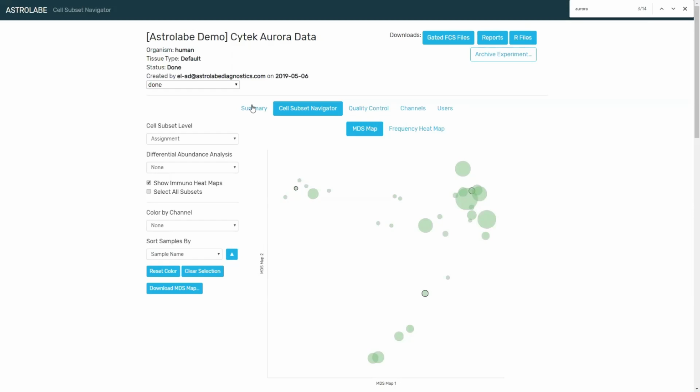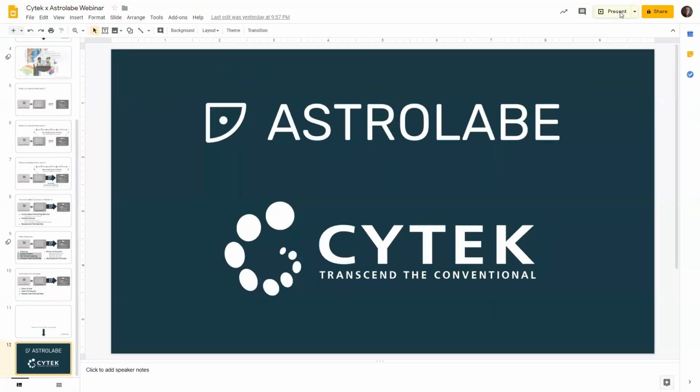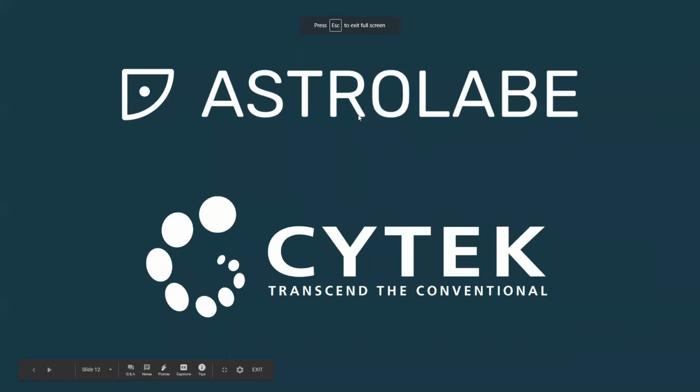Also, you can think about unmixing, where we are feeding in these references that Janelle beautifully presented. We have the spectrum for each dye, and then in the multicolor sample, we have a mixture of all those spectra. What we do with the unmixing algorithm is to understand, in that mixture in the multicolor sample, which of the individual signatures fit. So mathematically, there is commonality, but there are also differences because of the kind of matrix that you are resolving.